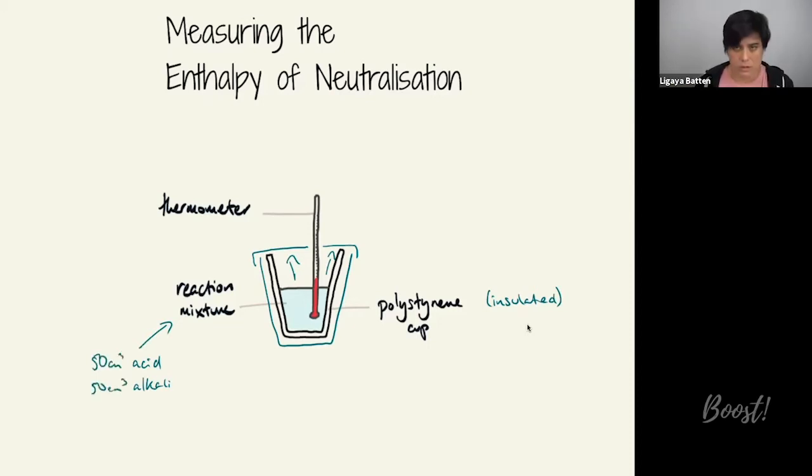And we would also usually want to make sure we know the concentration of the acid and alkali. And remembering back to what we were talking about, standard conditions, we might usually want these to be at 1 mole per decimeter cubed of concentration, so that we can compare our values that we get from our experimental result to some standard tables, for example. So you might want to know the concentration or set the concentration at 1 mole per decimeter cubed.